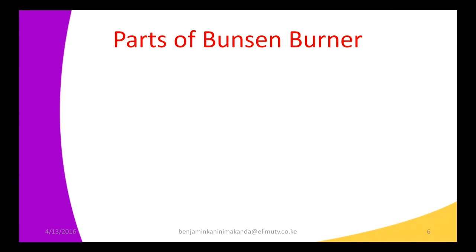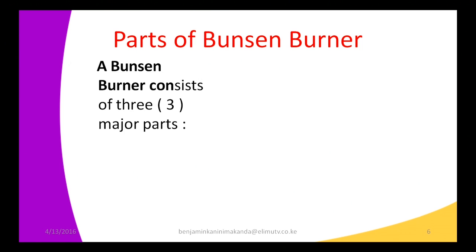We are going to look at the various parts of this Bunsen burner and how they are being used to produce heat. That's all about the Bunsen burner, but we have this other information about it. Parts of the Bunsen burner. So what are some of the main parts of the Bunsen burner?